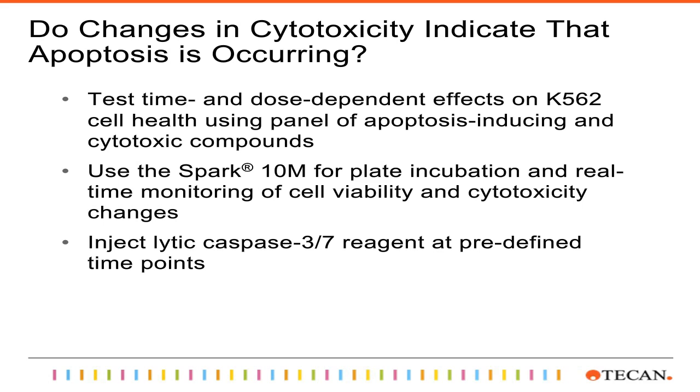So it's important to remember that in our first experiment here with the injection of our caspase-based reagent, we dictated when, at what time point, that reagent was going to be added into our test plate, which is a typical way of doing a time course type of experiment. So overall, what we wanted to do here was to get a snapshot or a high-level idea as to what was happening at various time points with these various biomarkers, particularly the cytotoxicity. And we wanted to see what was happening with the cytotoxicity biomarker and if that was any indication of apoptosis detection in our well.